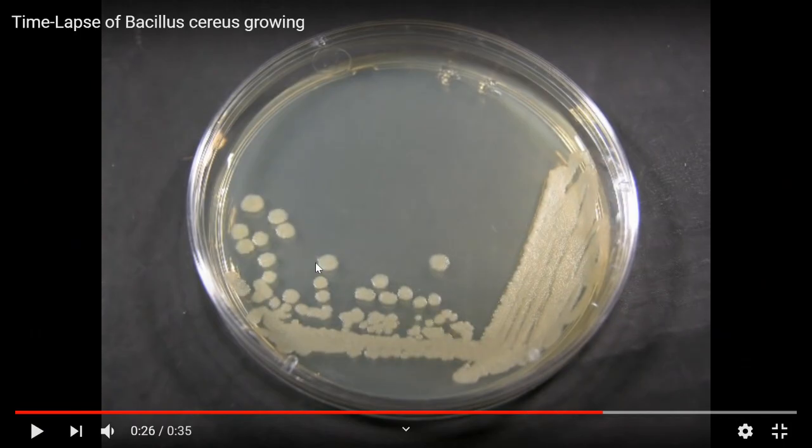But what we're seeing are the colonies develop. So zone 1 has the most, zone 2 has fewer, and then probably here they did zone 3, but they only got a few here, right? So they're just using one streak to pull bacteria. And so they got some here.